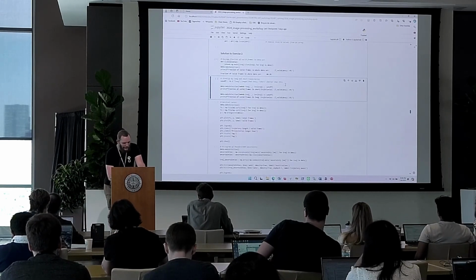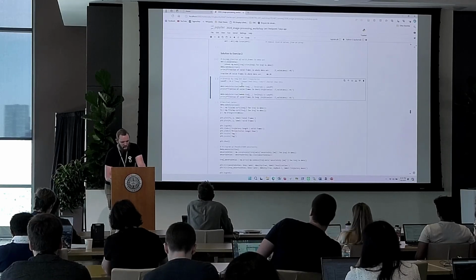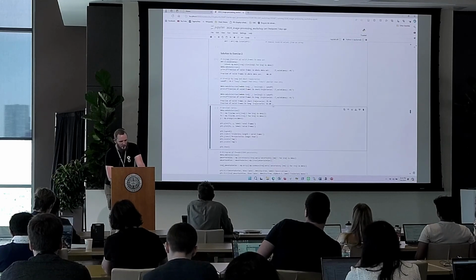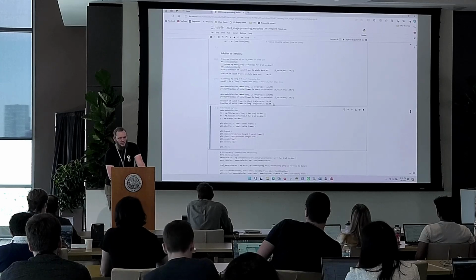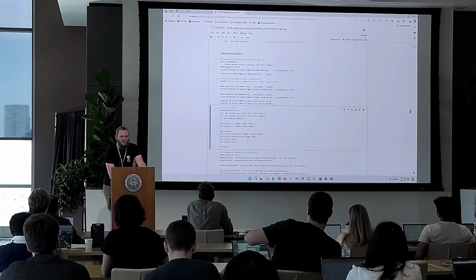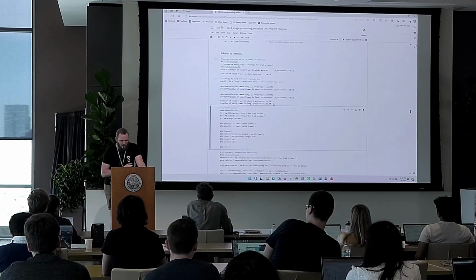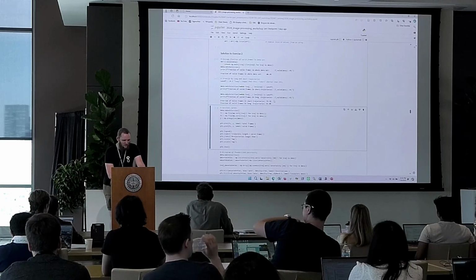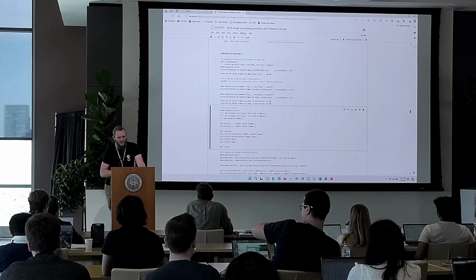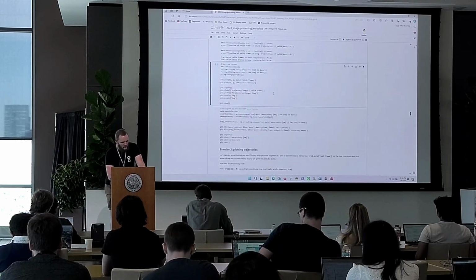We can stratify by long and short trajectories. We just set an arbitrary cutoff of 10 frames. And we see that the fraction of missing frames in short and long trajectories is very similar, which is a good sanity check, because that means that, at least with this very rough analysis, it's consistent with the missing frames being independent of trajectory length, which is good. We would be worried if it was otherwise.